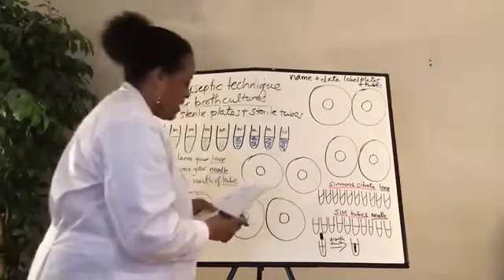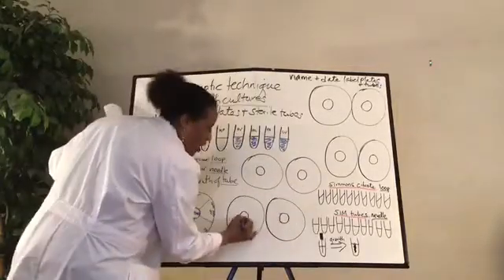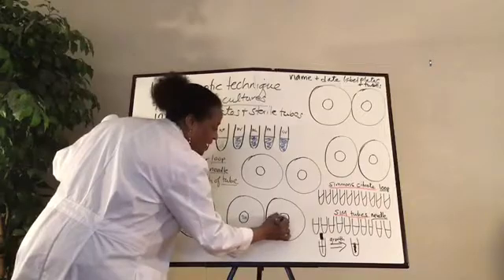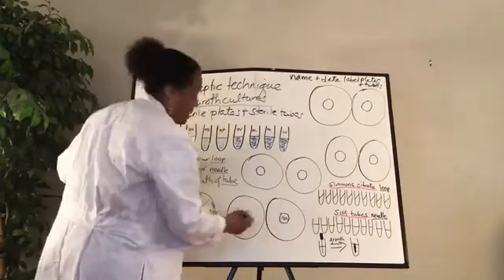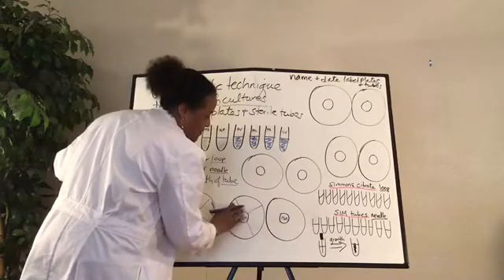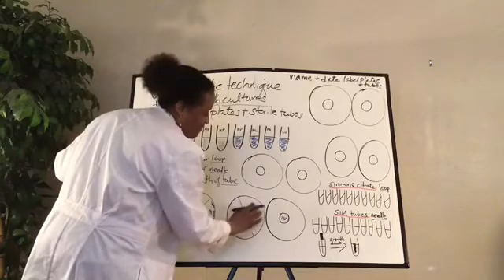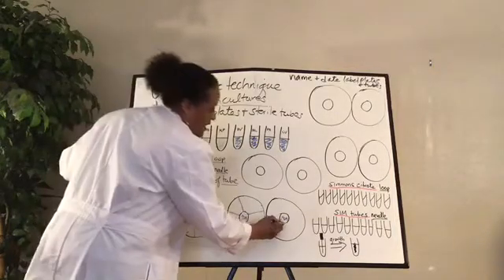This next one, let's do this as MSA. So just so I know which agar this is, because remember, they're all kind of red, so they all look alike. And I mean that in the best way, it does all look alike. So here is, let's make these 5 wells, right? And then this one.